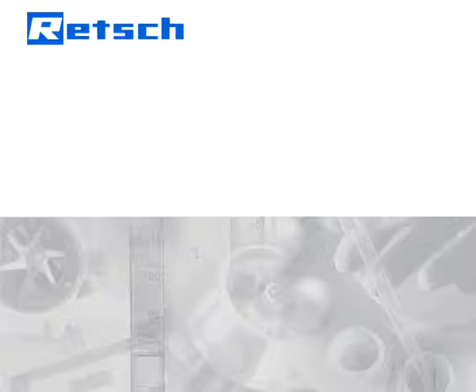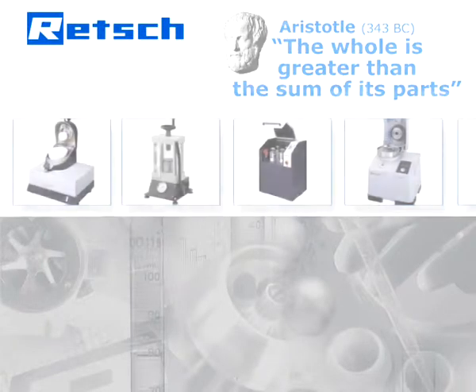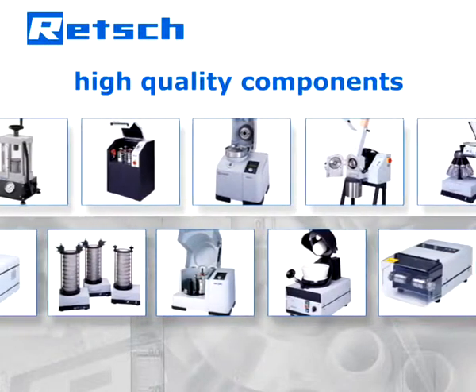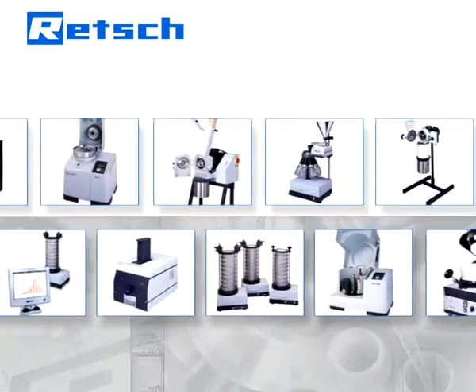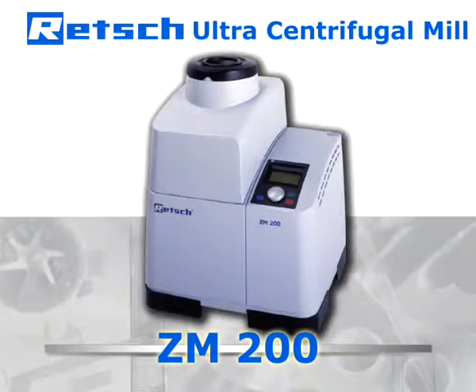Retsch's product philosophy is based on a quote by Aristotle: the whole is greater than the sum of its parts. Therefore, our R&D department does not simply choose high-quality components, but also pays full attention to the perfection of their interaction. It is this approach which determines Retsch's products to be superior and makes the ultra-centrifugal mill ZM200 the optimal device for excellent grinding results.